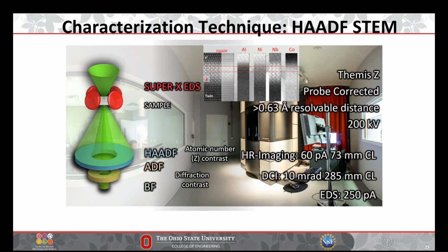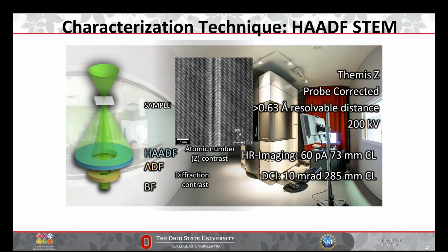The second reason is, physically, if you tilt something with some given thickness, you could even take your phone and look at it. If you were to put an electron beam through a zero tilt sample of thickness 50 nanometers, it will effectively increase the thickness if you were to alpha tilt to, say, 20 degrees, because the path the electron beam is taking is now longer through the sample. So you could have increased your sample thickness by a decent amount. To get really nice atomic resolution images using the HAADF detector, you want a really thin foil. But practically, you can do atomic resolution analysis with thicker foils and with higher tilts. You just don't get the data quality that you get with thinner samples.